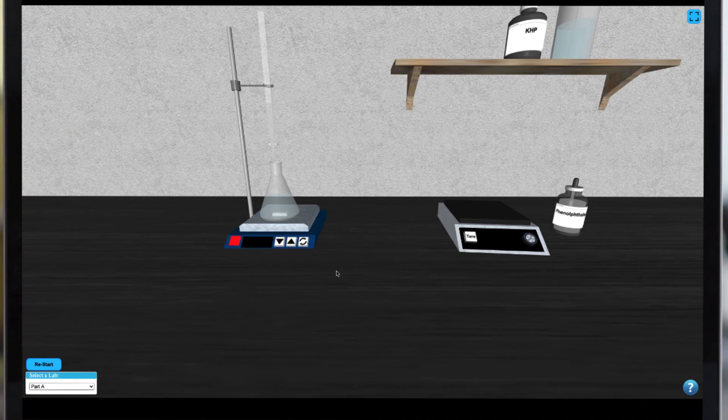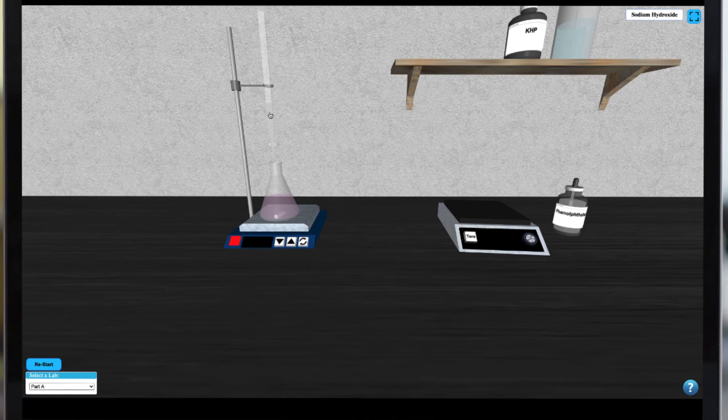At this point you may read the final volume from your burette and the titration is complete.